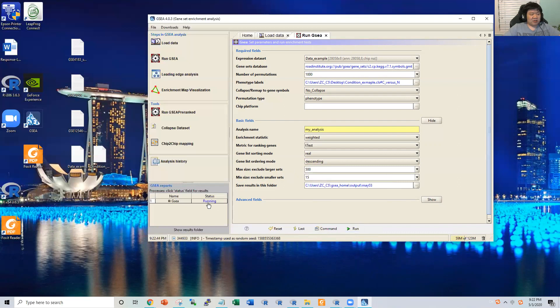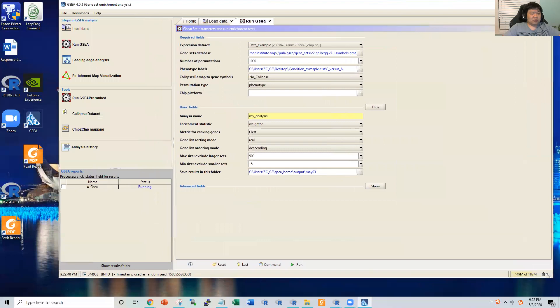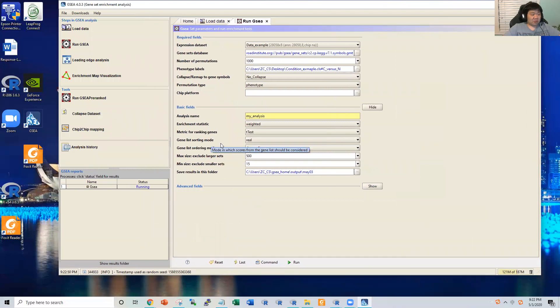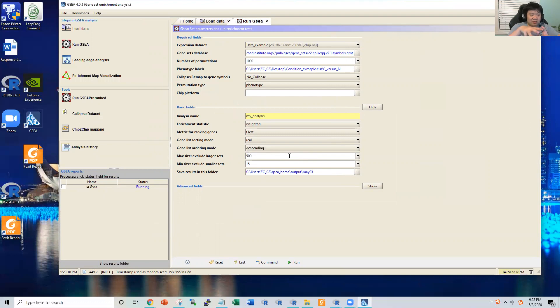GSEA is now running — it may take some time due to the permutation test required. Permutation means you randomize the data and run the exact same process one time. If there are 1,000 permutations, the algorithm needs to be run 1,000 times for background assessment and one time for the real data analysis.